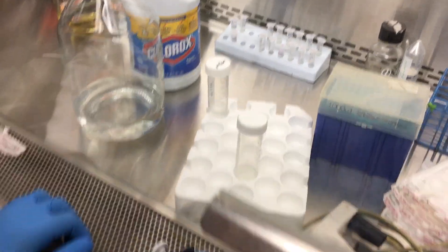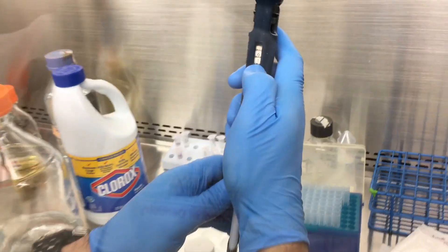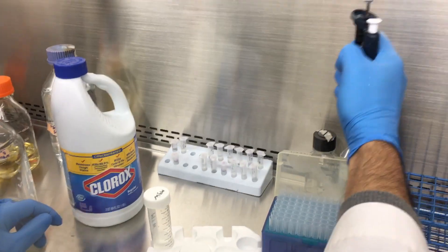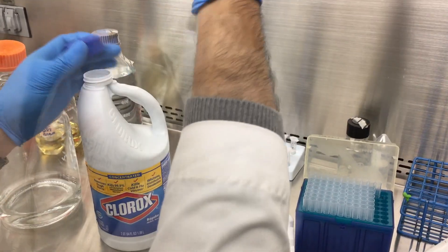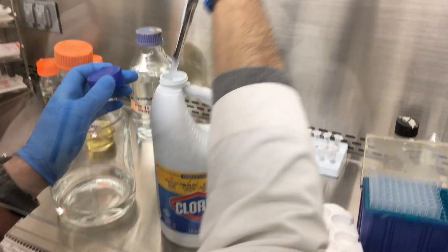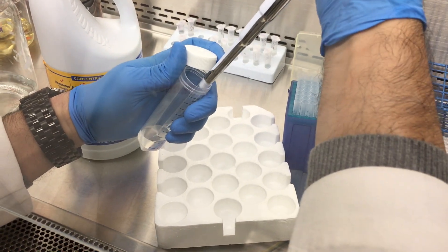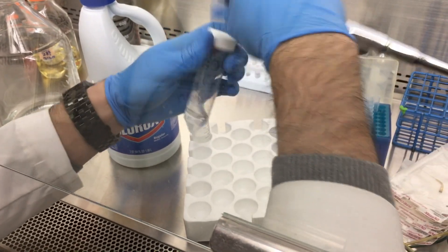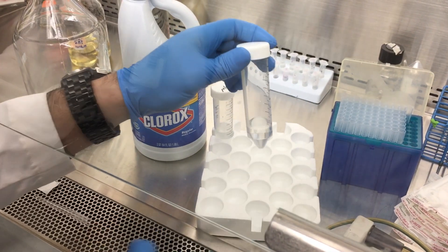Then we add 0.61 ml of sodium hypochlorite from the stock solution, which is 8.25%. Now we have 0.5% sodium hypochlorite at a 10 ml volume, but we need to adjust its pH.